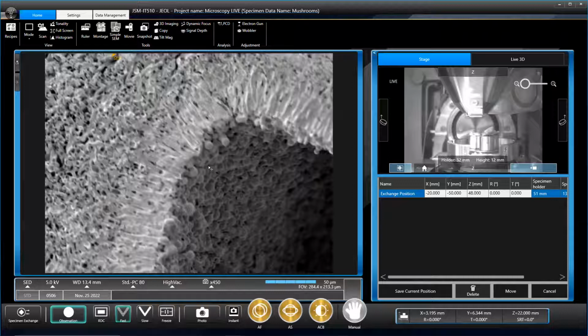They also produce their own kind of airflow to help the expulsion of the spores as well. So some species can do that. Oh, is that what I read somewhere, that they make their own wind? Yeah, that's how they do it. Oh, cool.